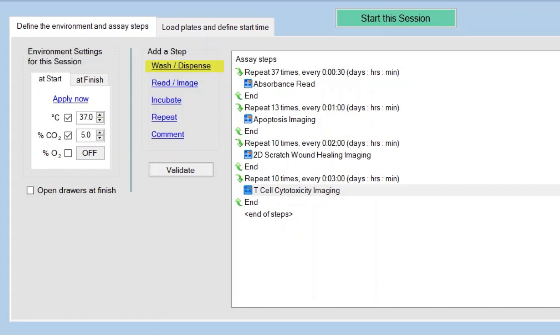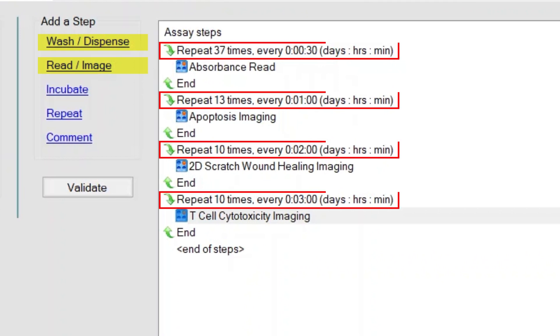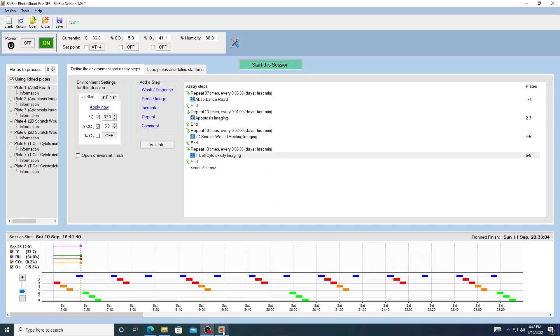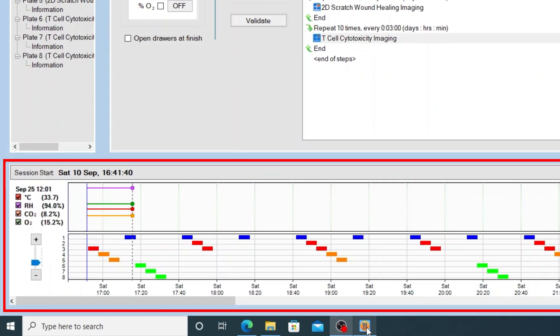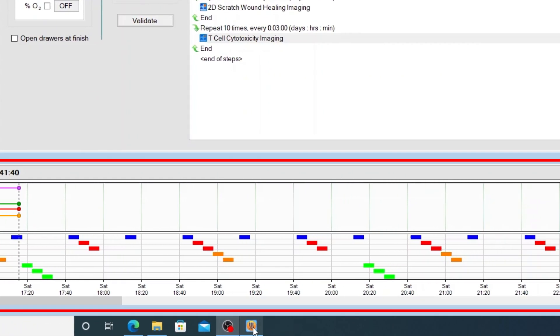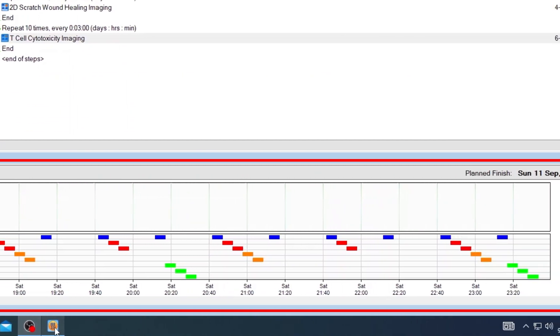These can be liquid handling, reading or imaging protocols with varying intervals for when the steps should be performed. The scheduling algorithm within the software automatically computes how the different protocols fit together to maintain proper timing for each. This is displayed as a Gantt chart to the user where individual processing of each vessel and real-time monitoring of environmental conditions can be seen.